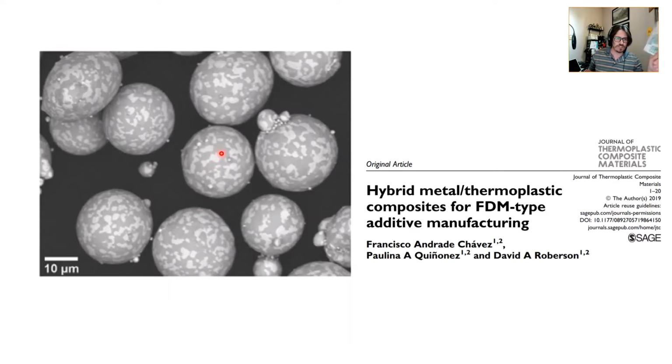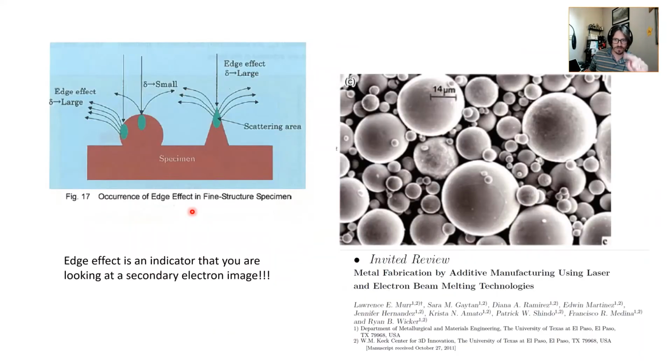When I started talking about these spheres, I talked about particle distribution, and then I cut myself off. You see I have these little satellite particles. This means that this solder, or this tin bismuth alloy, if you will, was formed by gas atomization. And if you had me for material energy balance, hopefully you remember the gas atomization problems we worked through. Really cool stuff.